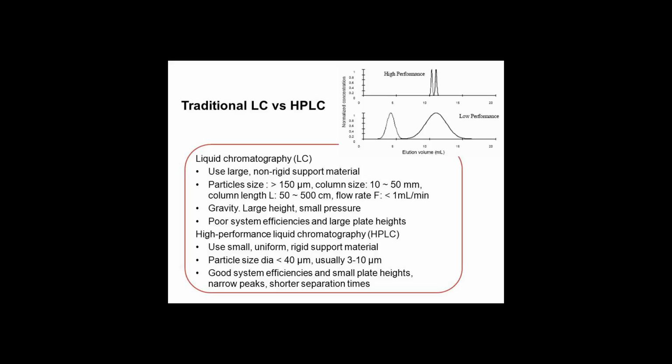Types. Partition chromatography. Partition chromatography was one of the first kinds of chromatography that chemists developed. The partition coefficient principle has been applied in paper chromatography, thin layer chromatography, gas phase and liquid-liquid separation applications. The 1952 Nobel Prize in Chemistry was earned by Archer John Porter Martin and Richard Lawrence Millington Synge for their development of the technique, which was used for their separation of amino acids.